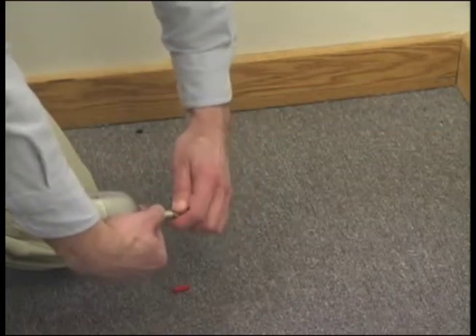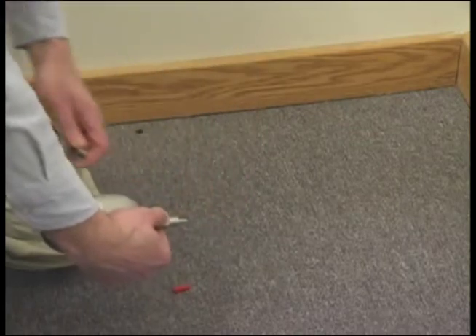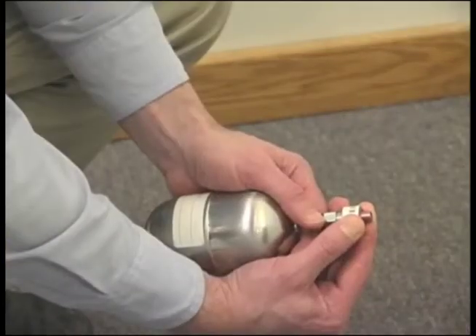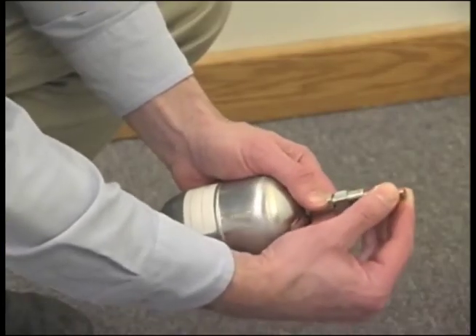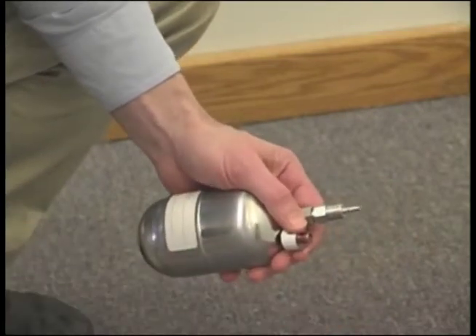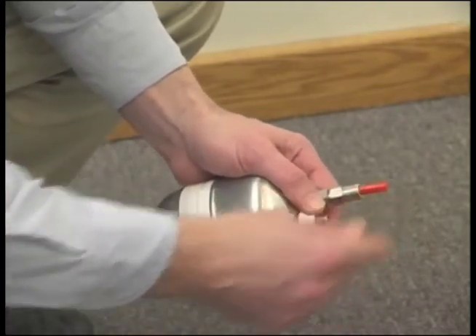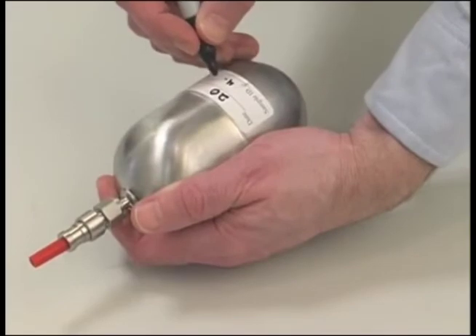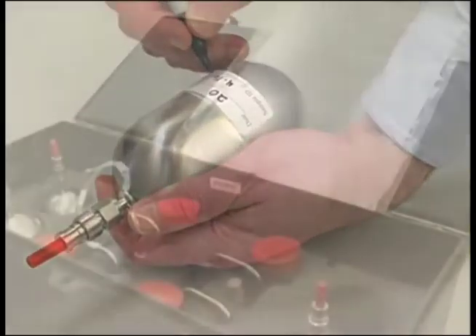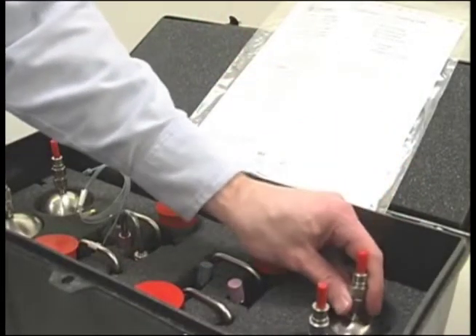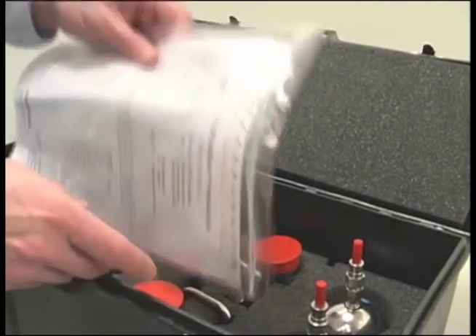When done, pull back the collar of the regulator and remove the regulator from the can. If using the regulator that does not attach, simply remove the regulator. Recap the inlet stem of the can and label the sample with your sample ID and date. Prepare the chain of custody and repack to ship back to Galson Laboratories.